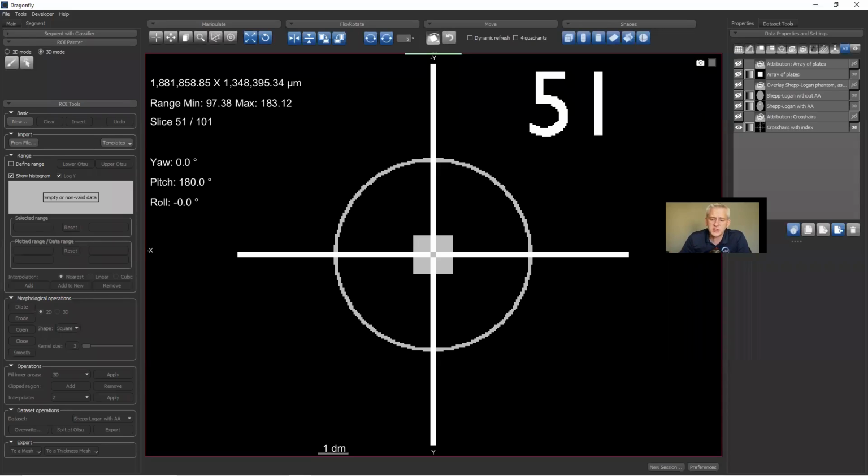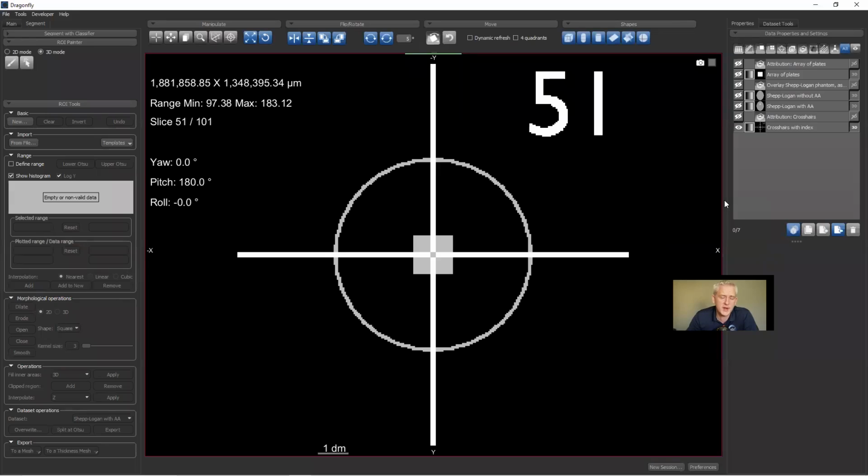The data I'm using today, we can post these all on the Dragonfly landing page where you can go to the sample data sets and then find these posted later today. I intend to post them. We're going to work with 3 different data sets. The first data set we're looking at, and all these are just synthetic data sets. They are phantoms to illustrate concepts.